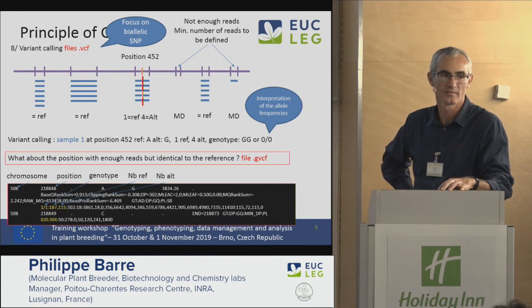It's shown here in a simplified way, but there's a lot of statistics going on between the read depth and the actual interpretation. There are many different variant callers. Some of them use Bayesian statistics, others use other types of statistics, but there's always a distribution of read depth behind it, and a certain chance to call it homozygous, a certain chance to call it heterozygous. Okay, now I understand where this comes from.